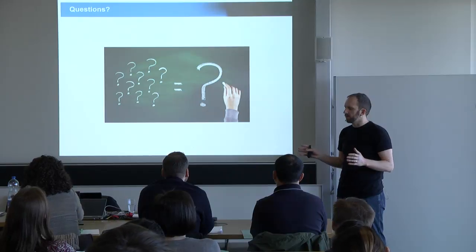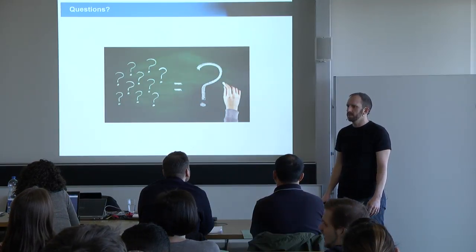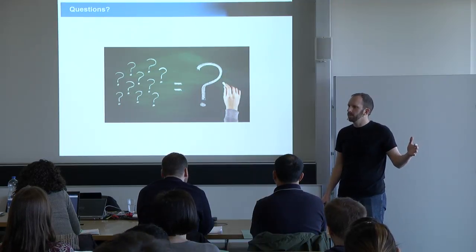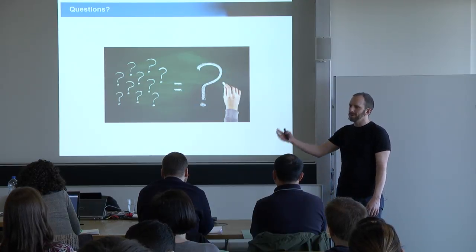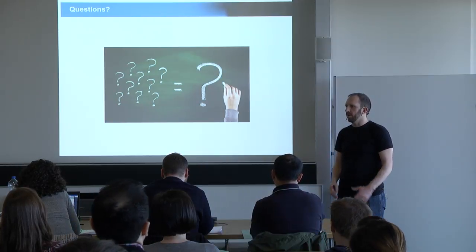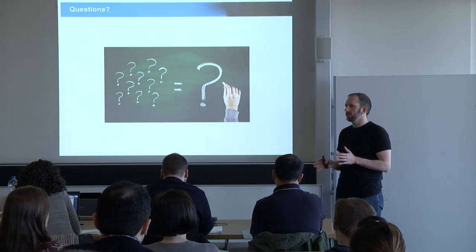To go through the procedure, you could do it in a day, basically, not counting the data collection. The data collection would probably take a day as well for these 3 files, and then another day for the sample processing. If you know how to use all the tools and you're familiar with everything, then it's pretty straightforward. If you have several hundred files, then it's the time it takes to actually measure and search these.